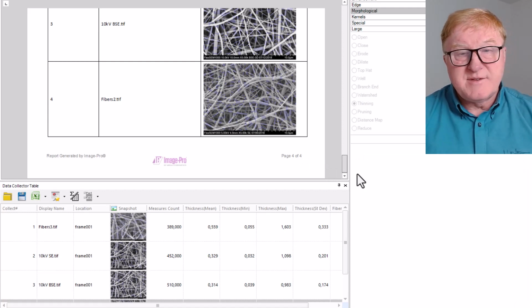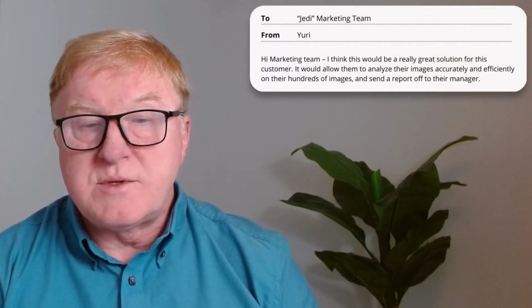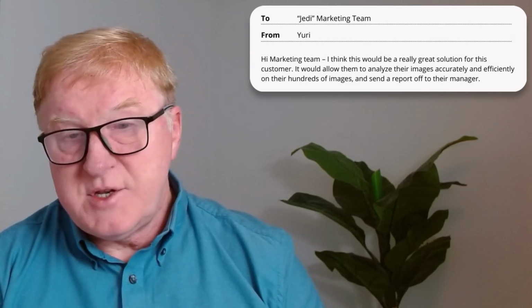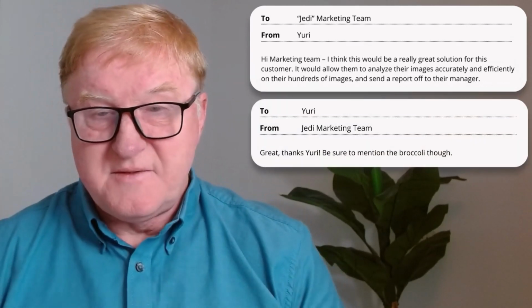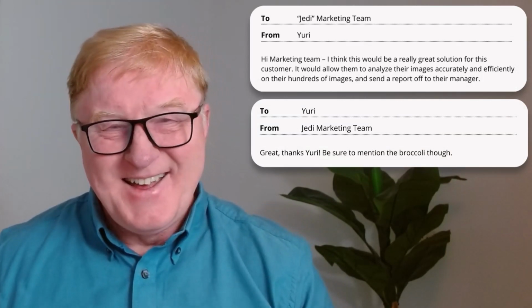All right, let's get the solution off to the marketing team so the customer can get started. Two hours later, I'm back. I just typed a message to the marketing team letting them know that I think this would be a really good solution for the customer. It would allow them to analyze their images accurately and efficiently on their hundreds of images and send a report off to their manager. Oh, looks like the marketing team already responded. They said, great, thanks Yuri, be sure to mention broccoli. So yeah, okay, sure, I'll do that.